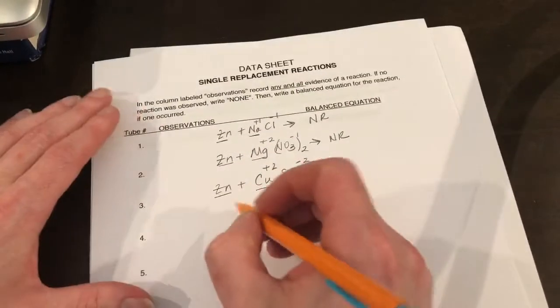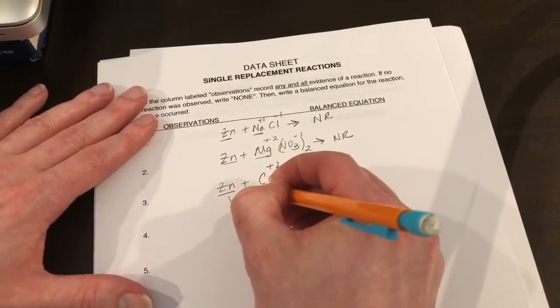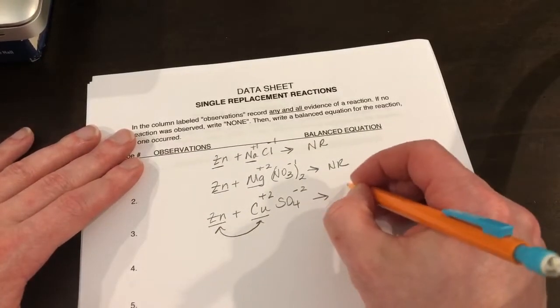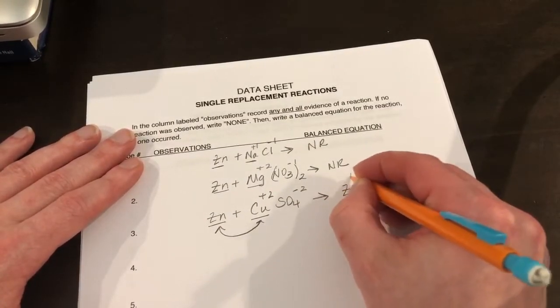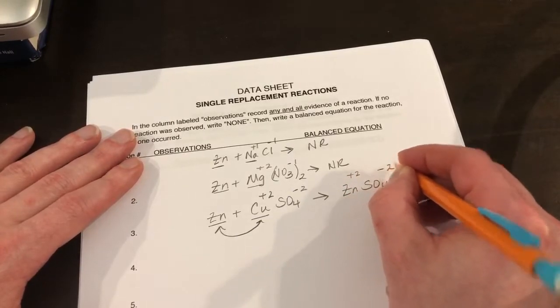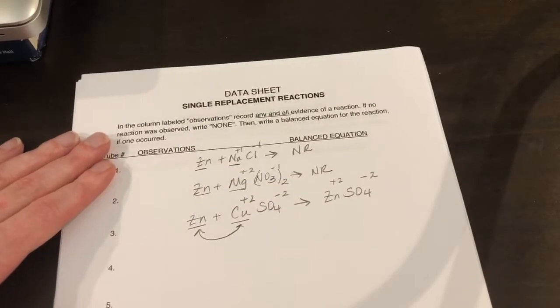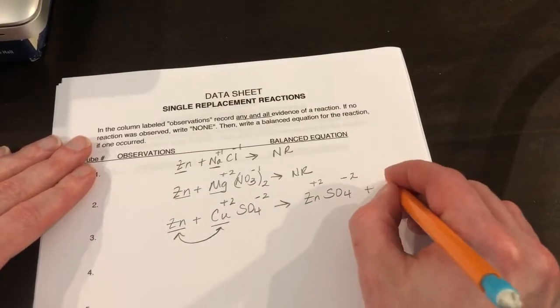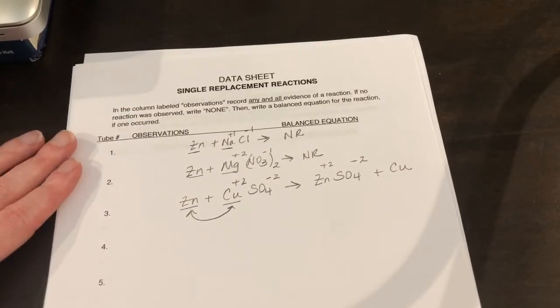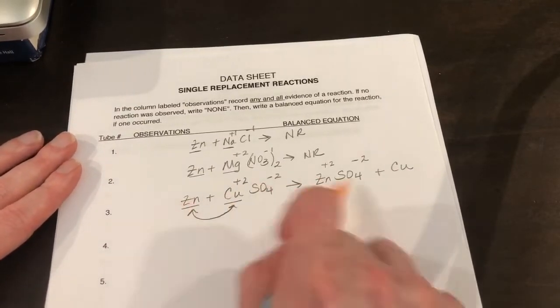Okay, so we're going to switch those out, and we get zinc, which always has a +2 charge, and sulfate with a -2 charge. No need to crisscross because they're equal and opposites, and we're going to kick out the copper. Everything should be balanced because there's one of each.